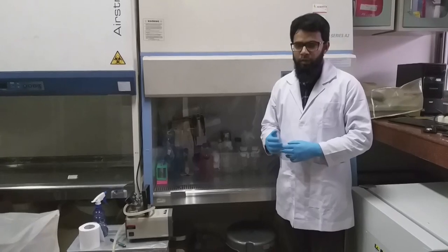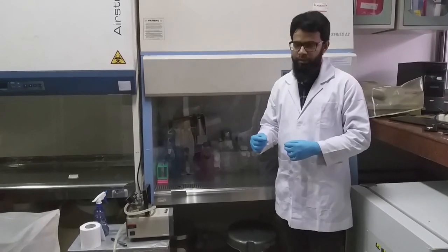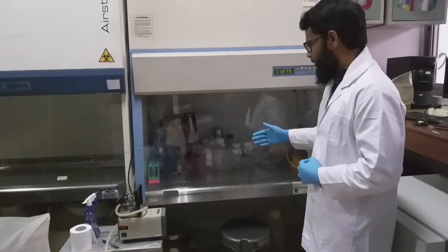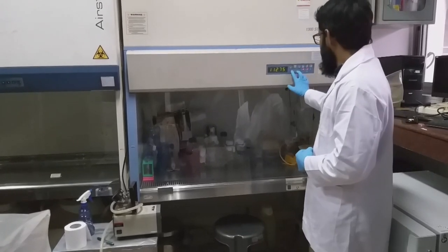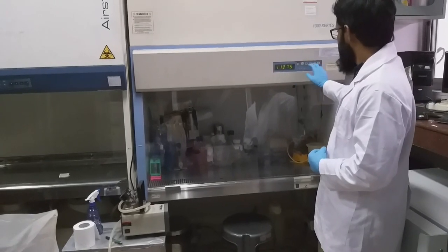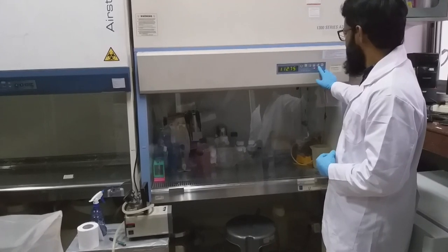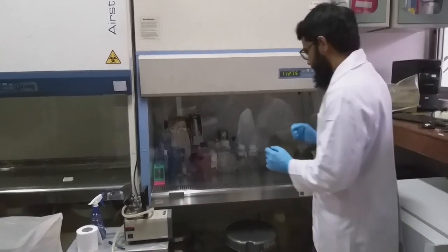For that purpose, we use class 2 biosafety cabinets which are used for handling mammalian cell cultures. So this is a typical biosafety cabinet in which we perform the filtration for media. This is the control panel which is used to operate this machine. This is the on and off switch. This is the switch for normal light. This is the switch for UV light. Now I will be demonstrating how to filter the media.